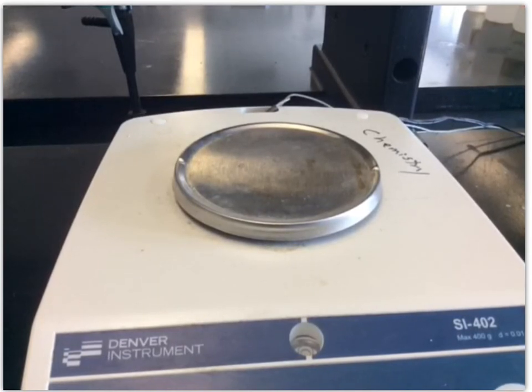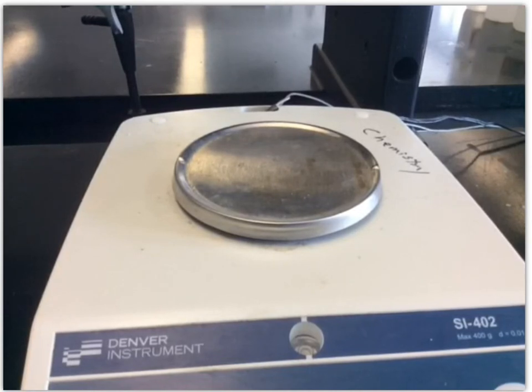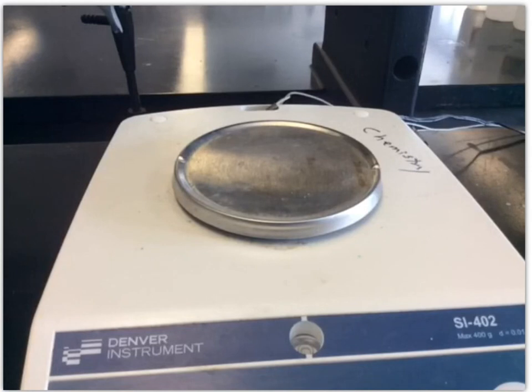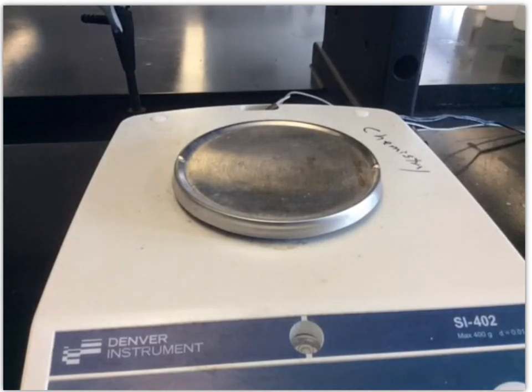Okay, so now we have all of our initial and final masses and volumes. So again, you need to take the final values minus the initial. That will give you the mass and the volume for each trial. And then you take the mass divided by the volume. That's going to give you the density of each trial. And then you can average those. And that average is what you're going to work with to figure out the concentration of this unknown solution. And then you just need to answer the questions that are associated with this part with the lab assignment.